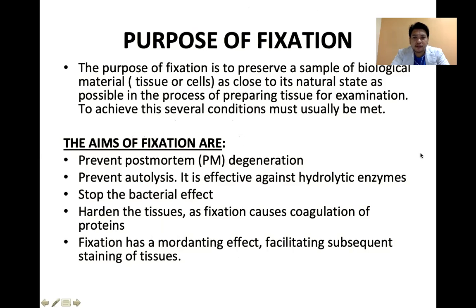Okay, so the purpose of fixation is to preserve a sample of biological material as close to its natural state as possible. The process of preparing tissues for examination requires that these specific conditions usually be met. So the aim of fixation is to prevent post-mortem degeneration and autolysis, stop bacterial effect, and harden the tissue, as fixation causes coagulation of proteins and has a mordanting effect.